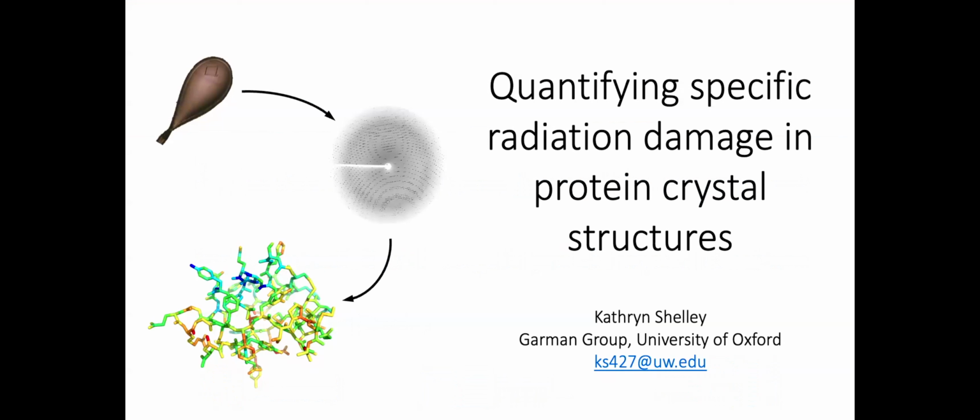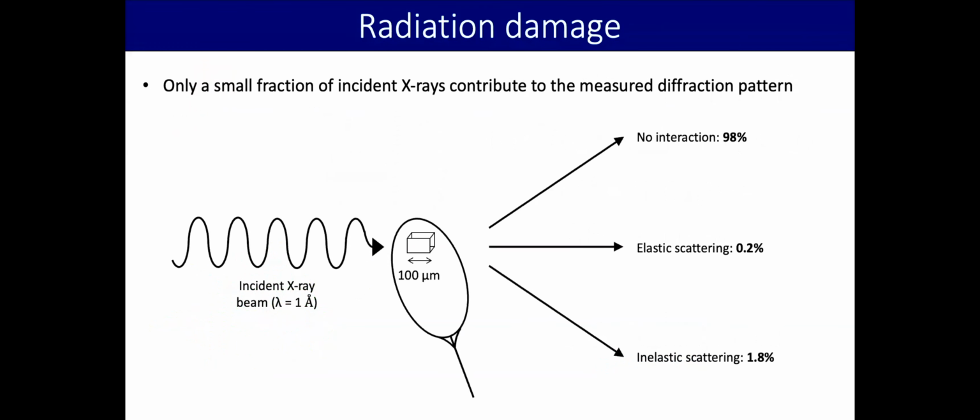The work that I'm going to present to you is some tools that I and others developed in Elspeth Garman's group to help you identify specific radiation damage artifacts in your protein crystal structures.